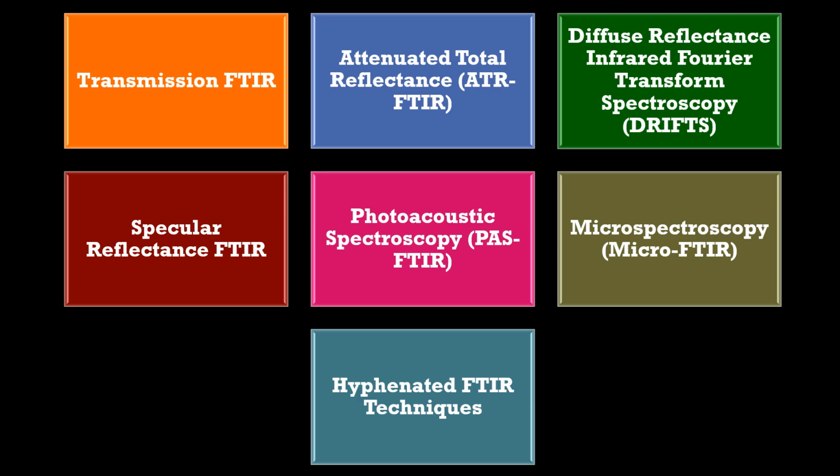They are transmission FTIR, attenuated total reflectance FTIR or ATR FTIR, diffuse reflectance infrared Fourier transform spectroscopy or DRIFTS, specular reflectance FTIR, photoacoustic spectroscopy or PAS FTIR, microspectroscopy or micro FTIR, and finally hyphenated FTIR techniques.